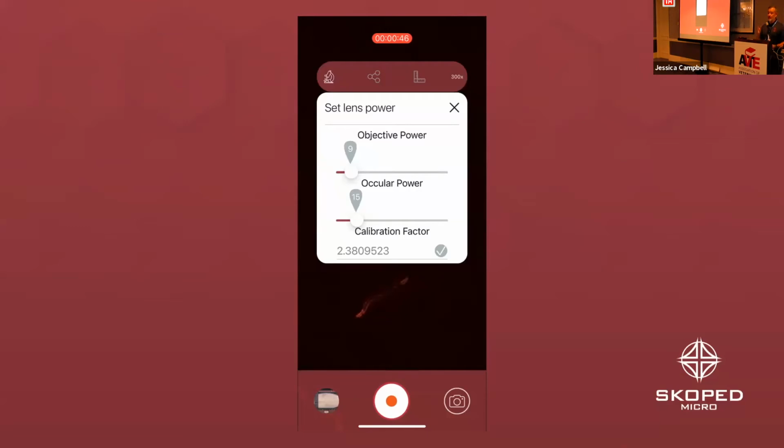Once you figure that out, you just write the number down, and there we go. Forever and ever, that's your number for dead on micron to micron. And so that allows a pathologist or a parasitologist to know you're right. That allows you to know your technicians are right, or deviate in between different parasites.